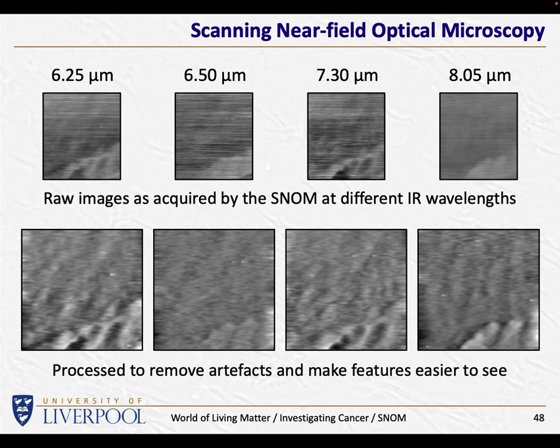So here we've got the wavelength of infrared radiation that we're shining on the sample, and regardless of what the hell that means, and it's taken us a while to work out what it actually means, the point is that this tissue absorbs differently at different wavelengths. So that gave us the idea that, okay, there's an angle here, we might possibly take this idea, we need to do better than that. This is just the first step telling us that it might be possible.